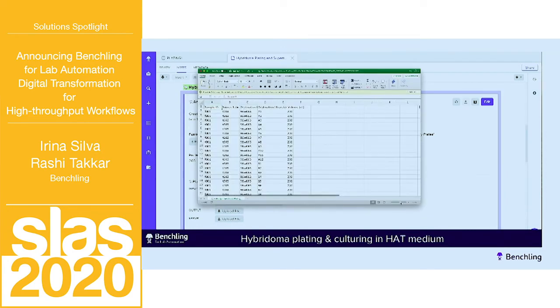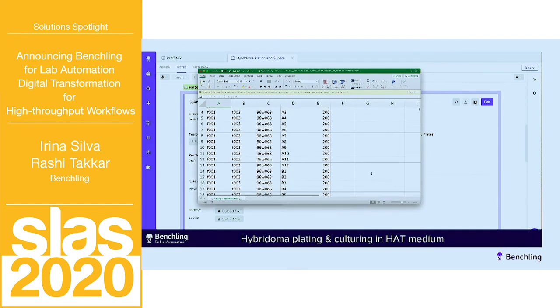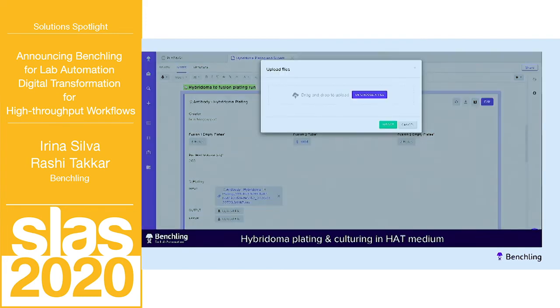So let me just pause here for 2 seconds. This is the input file that you're going to be providing to the liquid handling robot. So in this case, it contains what the sample ID is, what's your source tube, what's your destination tube, destination well, and what the transfer volume is. Your liquid handling robot will take this information and then execute the method. And once it does that, we're going to be ingesting the output. So here you can see the way we're doing it, we're actually doing it in the user interface. And it's very, very easy to do. However, if you want that automatically done, we could build a custom integration for that as well.